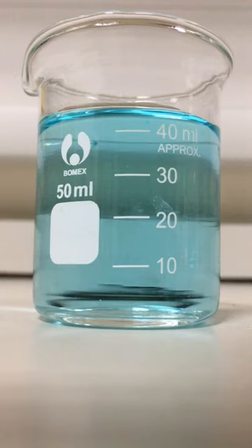First of all, we have a solution of copper 2+, it's good old copper sulphate. Remember, copper ground state is 4s1 3d10, so copper 2+ is 3d9. We have unpaired d electrons in the copper, which is giving a phenomenon of colour. It's absorbing the red end of the spectrum and transmitting the blue end to your eye, so it does appear blue to a human being.